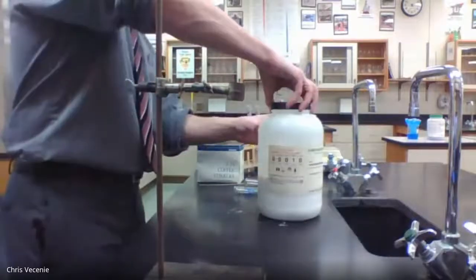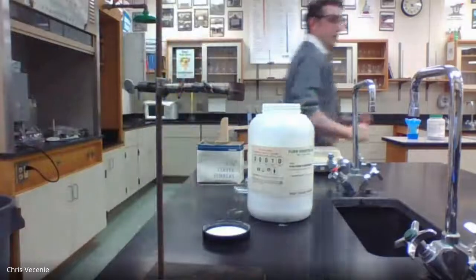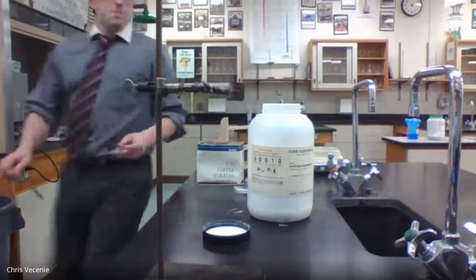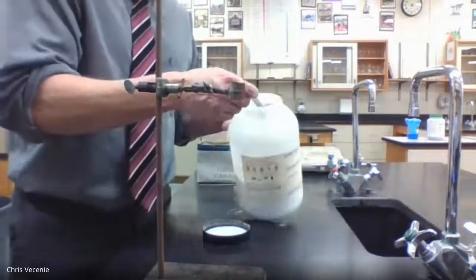So I'm going to take a scoop of my calcium carbonate using my scoopula. It's just a white powder.